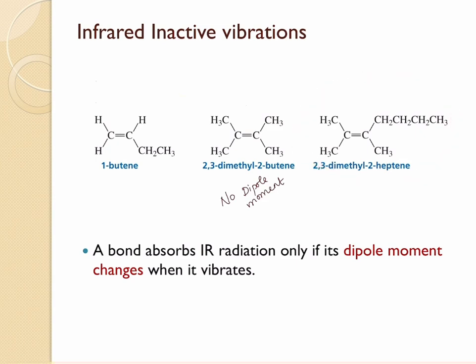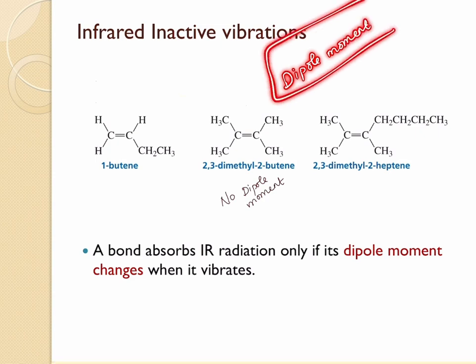So in order for a compound to be infrared active, there should be a change in dipole moment. That is the most important thing. As the bond vibrates, there should be a change in the dipole moment.